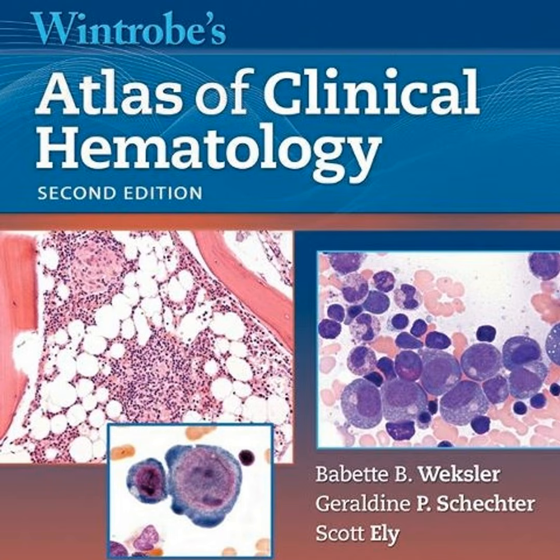The core principle here is identifying proteins, right? It is. What's on the cell surface or inside the cytoplasm, you tag those proteins with fluorescently labeled antibodies. And there's a crucial practical limitation here. Yes, you need viable cells, live cells. If the cells are dead, the antibodies just stick everywhere non-specifically, and you get a ton of background noise that makes interpretation impossible. Now, the atlas suggests that for most clinical purposes, 4 to 8 colors are enough, even though the tech can do more. Why not use 20 colors?